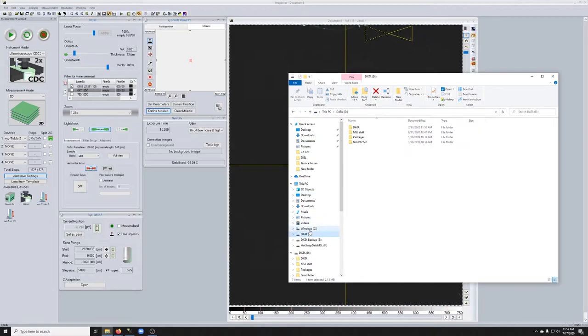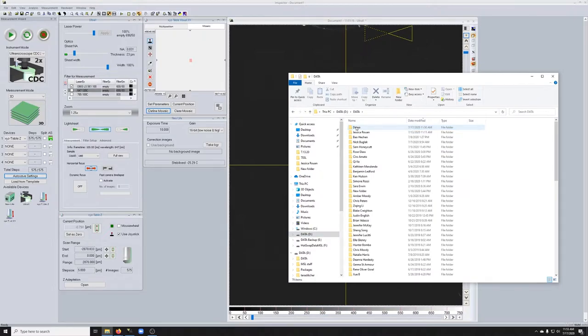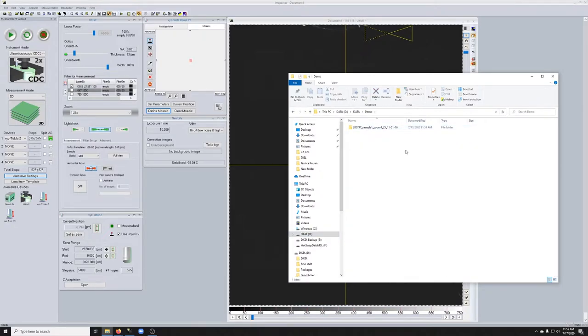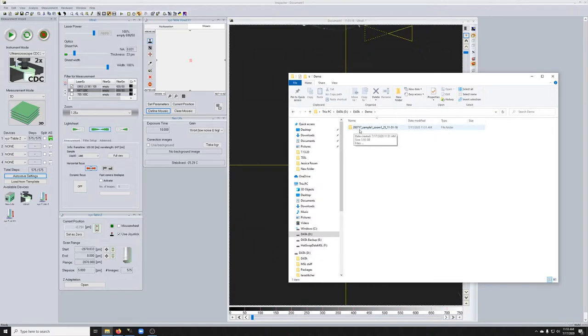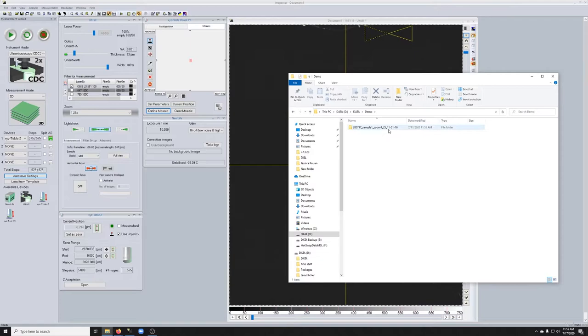So I pointed to the data folder on the D drive. Inside there, there's a folder called demo. And so you can see here it made a new folder. That new folder starts with the year, month, and day, the base name that I gave it, and then it has the time down to the second at which this started.